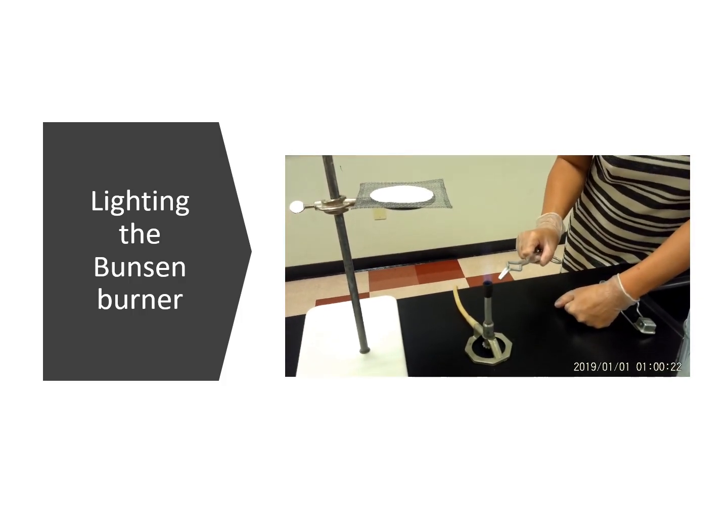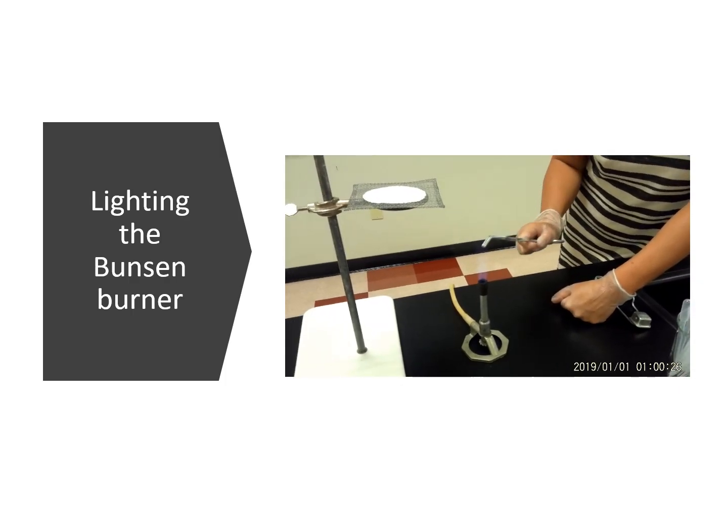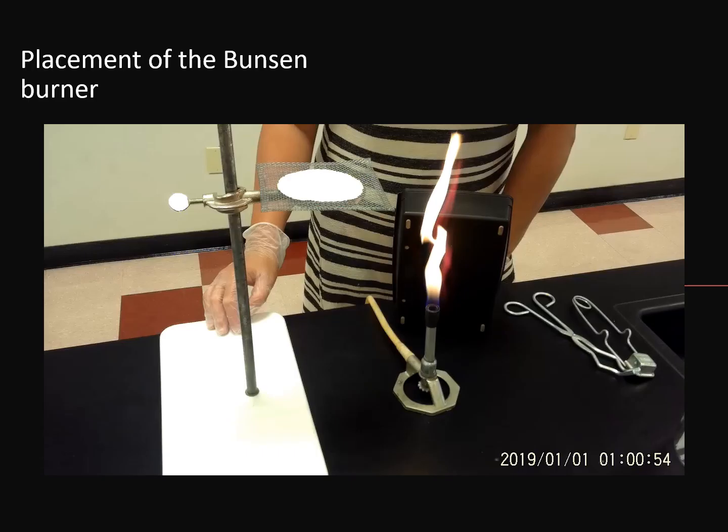In this Bunsen burner, this is the hottest part of your flame. Okay, so now that we know where the hottest part of our flame is, and we're using the tongs to show us where it is, then we can figure out how high our ring should be, to not be here, but be just above that. So let's talk about the placement.